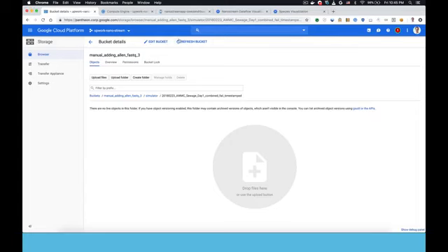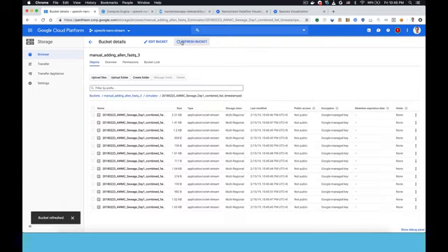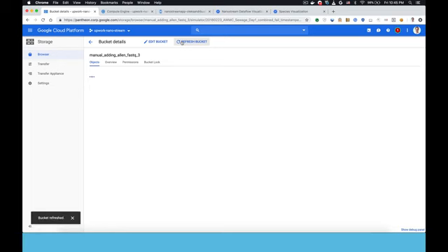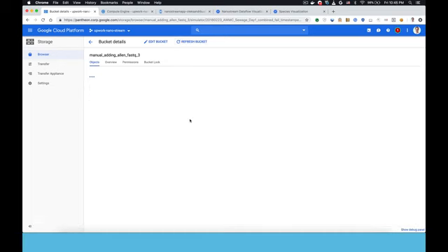As part of building this, we made a simulator so we could prepare samples and test them while we were developing. Here I'm showing we're going to upload some DNA reads from a sewage sample, which is what I was showing you a moment ago. It's written in Docker, so I'm going to kick off the Docker process, and it starts uploading DNA reads. Here's the bucket they're going to, and it was empty, and now you can see reads are appearing. The newest ones are at the top, so you can see the timestamps are increasing as these are uploaded.